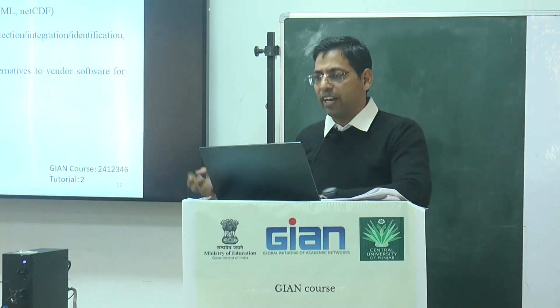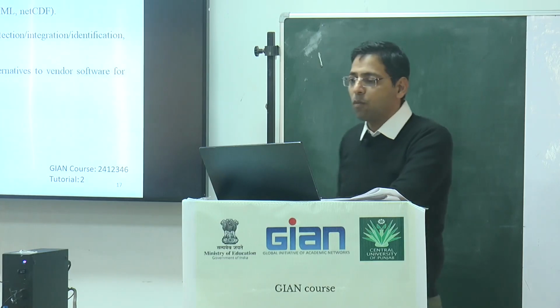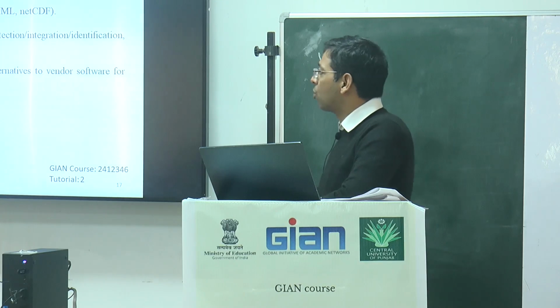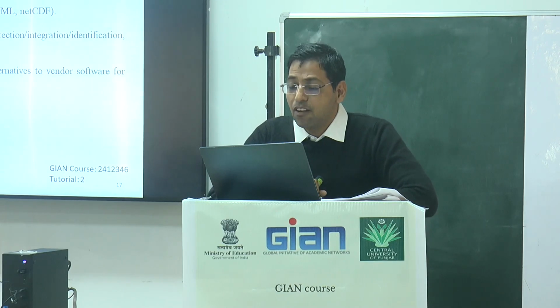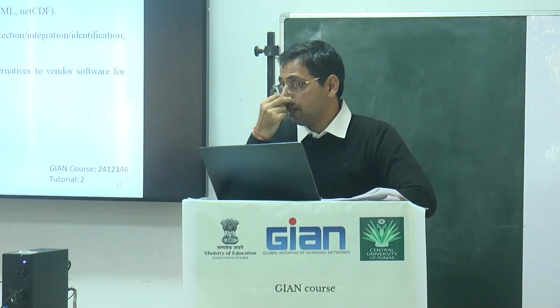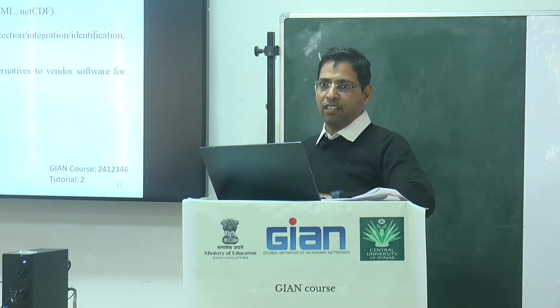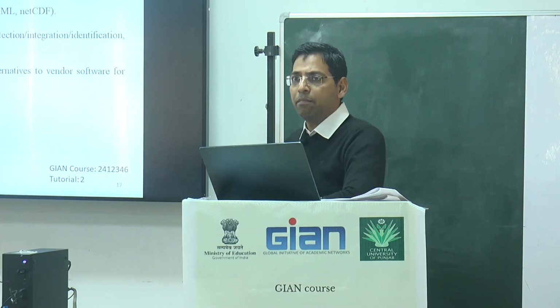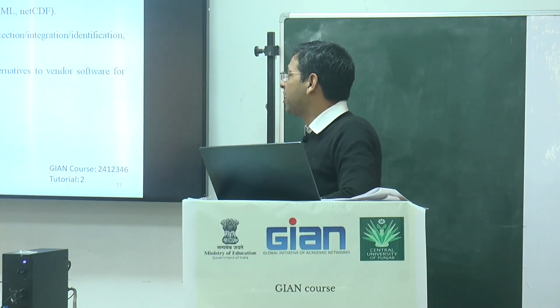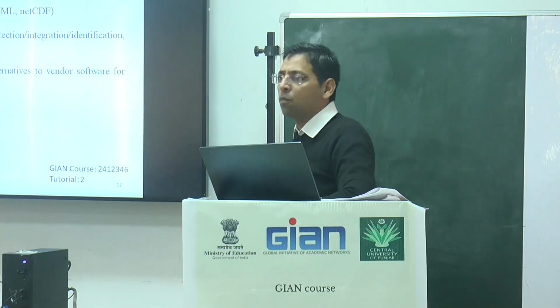These are paid software by different vendors, but this is the open software, OpenChrom. It is an open source and cross-platform software for LCMS data analysis and supports various file formats, which means you can use it for different files also. It has open tools for baseline correction, peak detection, identification, and mass spectra comparison. So these tools, along with MZmine and MAVEN, provide an alternative to vendor software for LCMS data analysis. For LCMS, you can use OpenChrom also.